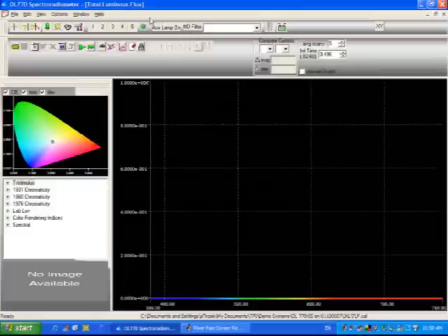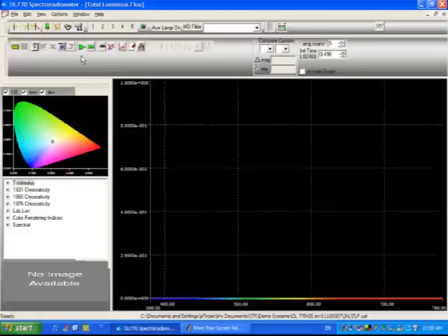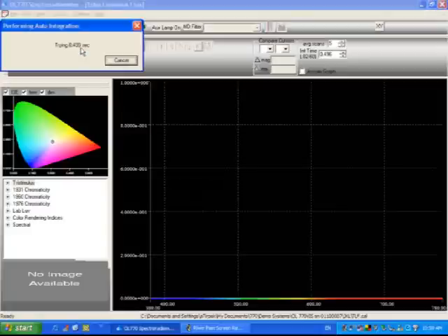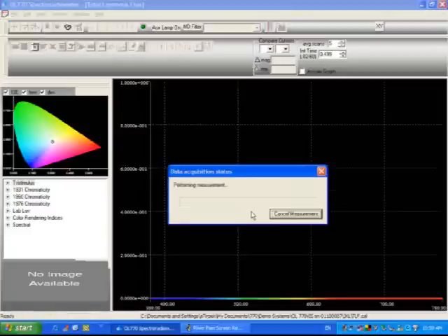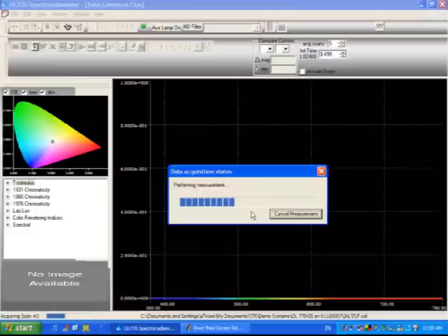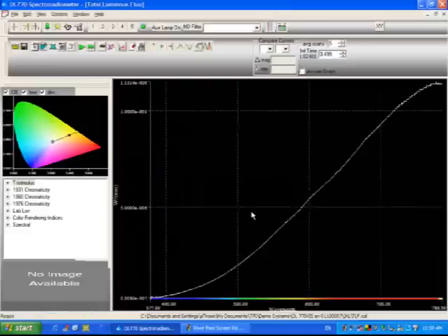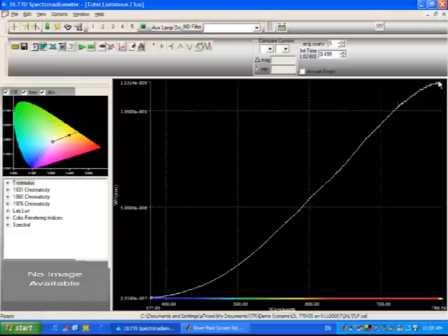You can see it's noted here that the auxiliary lamp is on, and we're going to go ahead and take a measurement of that, and again I'll take a measurement of five scans. Just click the play button, and we're now acquiring our five dark scans and our five measurement scans to average together. That's a typical plot right here of a tungsten-based lamp.